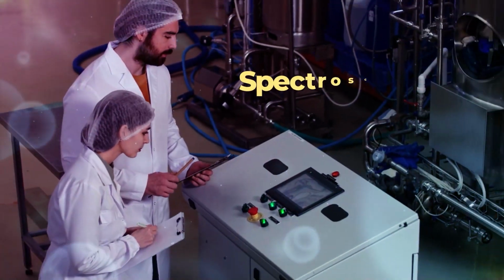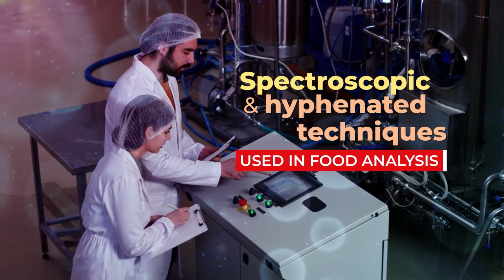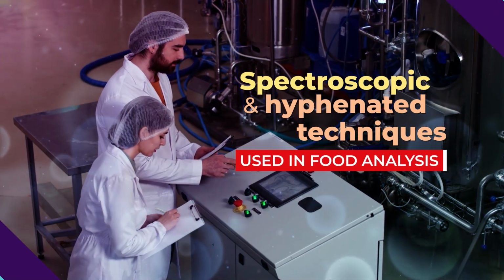In this session, we will cover hyphenated techniques and spectroscopic techniques. Before we go further, I must explain that all techniques, like chromatographic techniques or spectroscopic techniques, are all indicative. They are not confirmatory. Indicative because they only indicate with reference to what we carry out the experiment with.